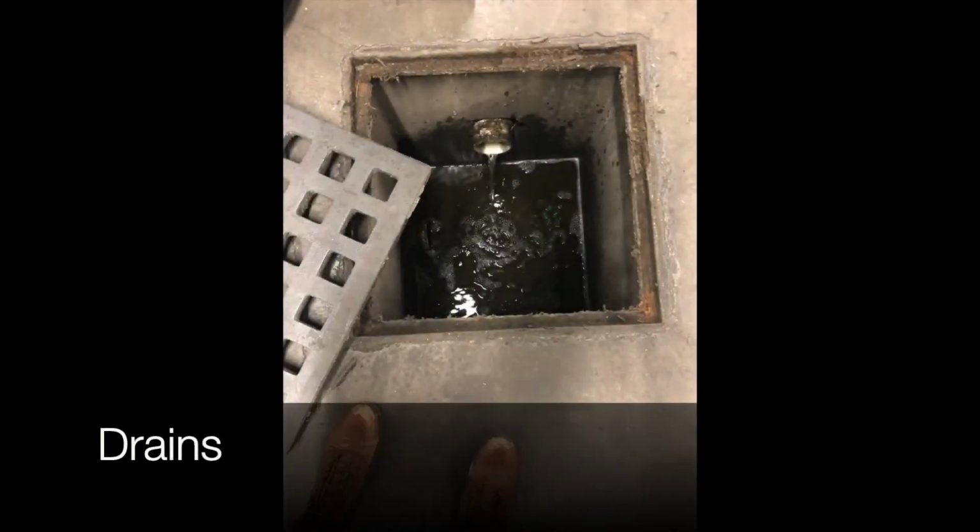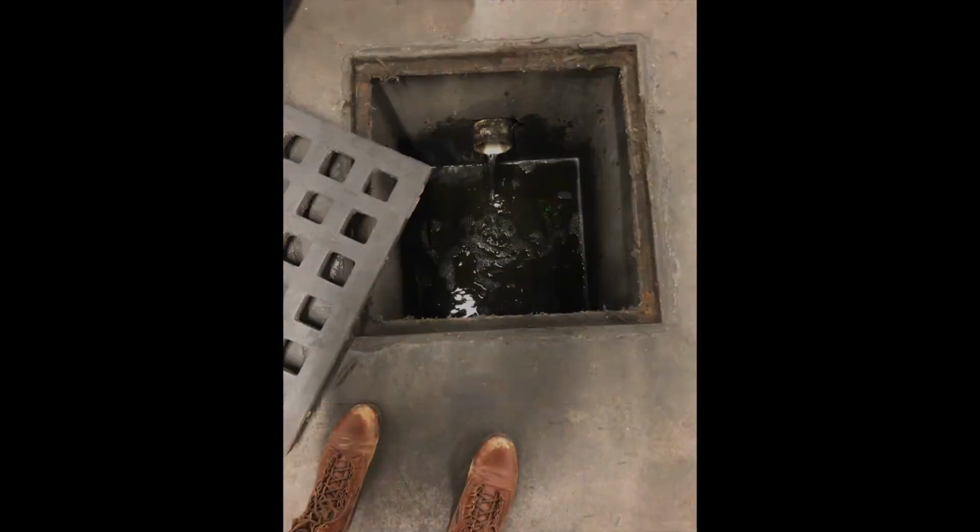Drains. Always sample drains because they are an easy way to capture the worst case scenario of the whole room, as water that has touched equipment and floors flows into drains. If Listeria are present in a room, it's likely that it will end up in the drain. Look at collection pans deep in the drains that usually don't get cleaned.